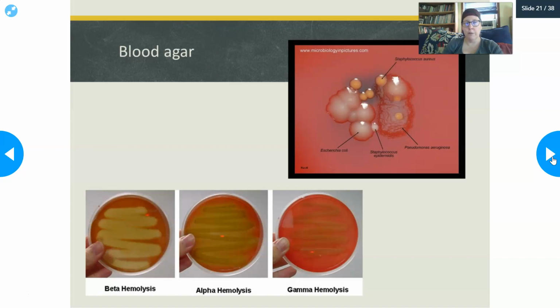So here's blood agar. Colonies can have various looks on blood agar. It is made from blood, sheep blood, so it's complex, and it allows for a lot of different types of bacteria to grow. I do want to note, if they make nice, pretty round colonies, they're considered non-motile. They don't move around. They just multiply and just mound up, mound up, mound up.